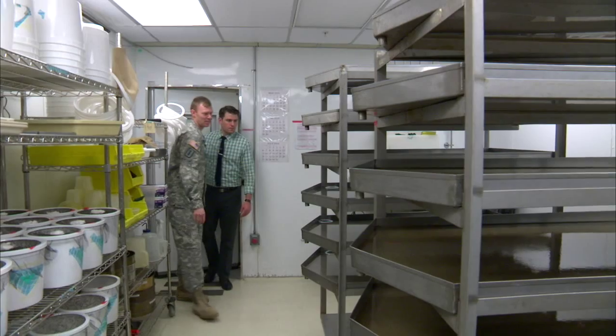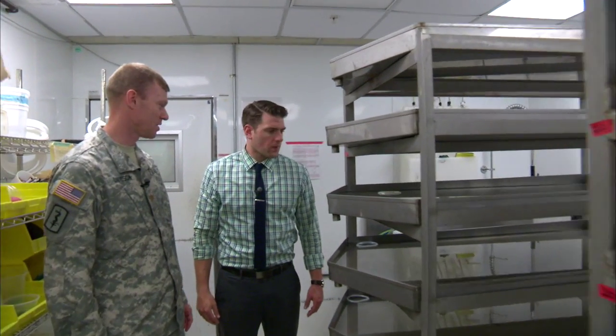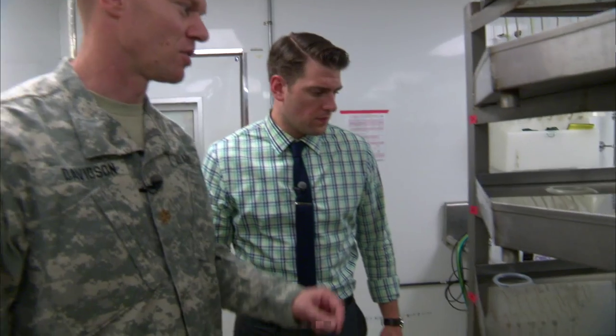So this is the insectary where we raise our mosquitoes. You'll notice it's a little warm and humid in here — it's about 80 degrees Fahrenheit, 80% humidity. That's because that's how the mosquitoes grow the best. Because mosquitoes are aquatic, we have to rear them in water. So this is how the process starts.